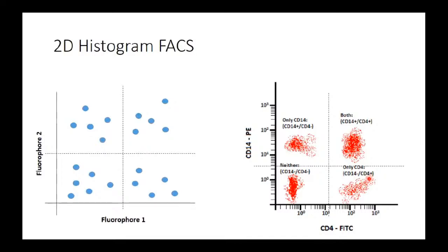As you know, in the new FACS machines, we can analyze tens of proteins and tens of cells at one time. There is now one FACS machine on the market which contains 10 lasers and 30 detectors.